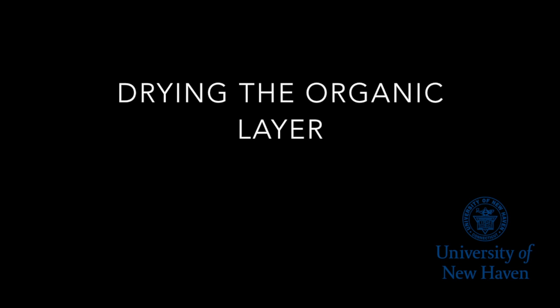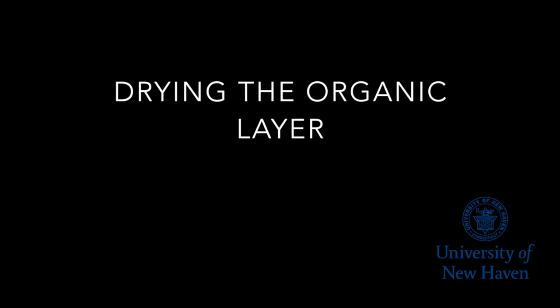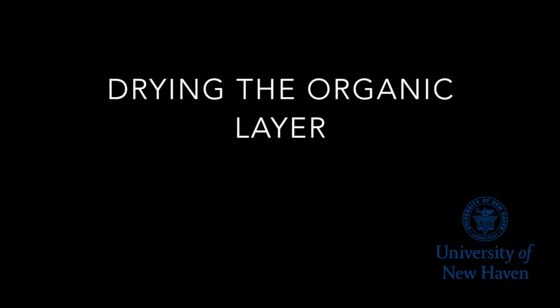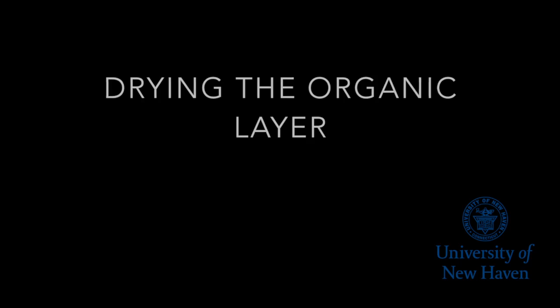In this video, you will learn how to dry an organic solvent. When an organic solvent comes in contact with an aqueous solution, it may contain some dissolved water.